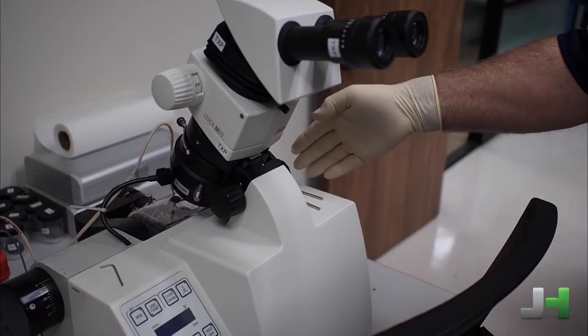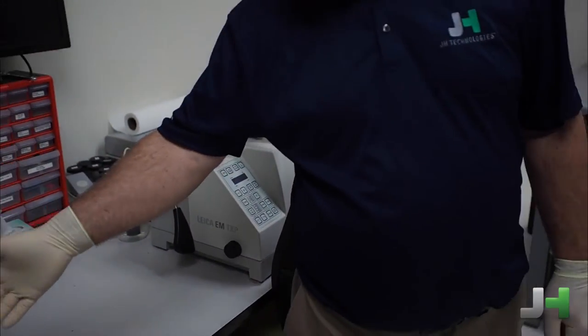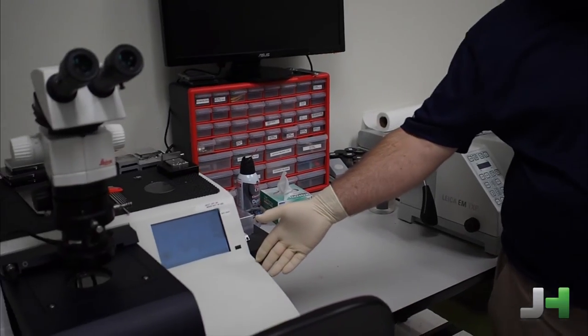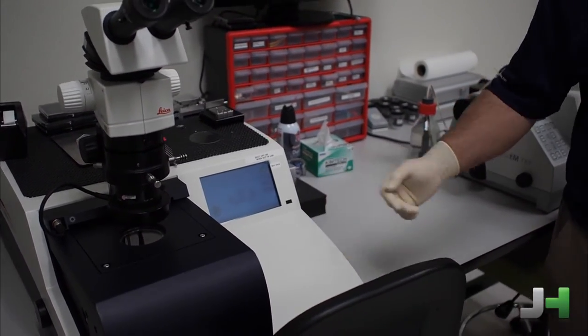And then once we've got down to the levels that we want, we can take it to the ion mill. This is a Leica EM3 TX for final polishing and preparation prior to going into the SEM.